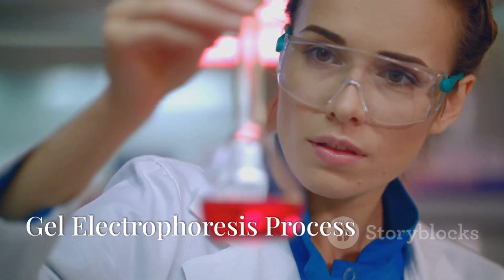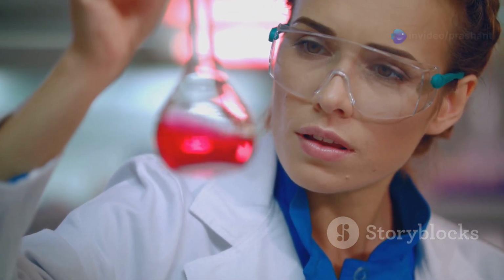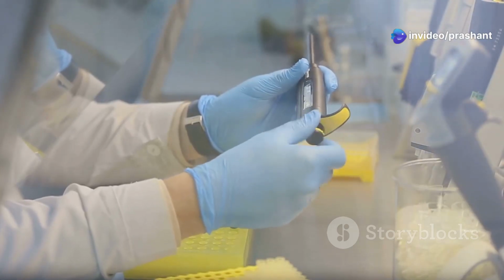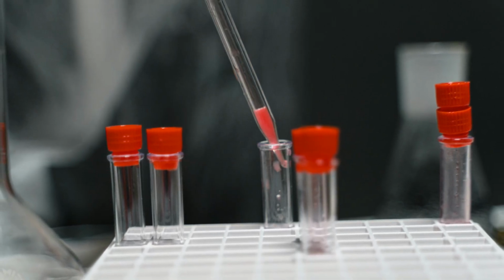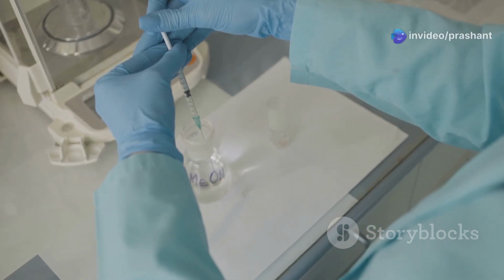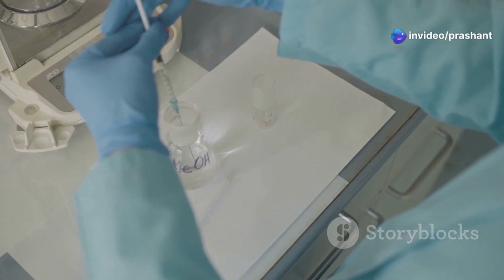Let's take a closer look at gel electrophoresis, as it's especially relevant for many pharmaceutical applications. In gel electrophoresis, a sample is loaded into wells at one end of a gel slab. When an electric field is applied, the molecules in the sample start migrating through the gel. Smaller molecules move faster, traveling further down the gel, while larger molecules lag behind.